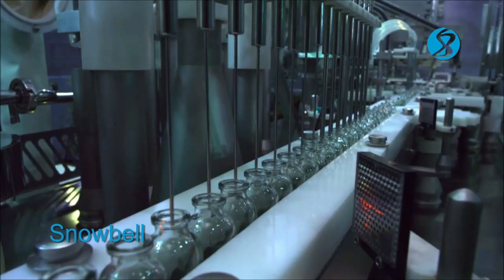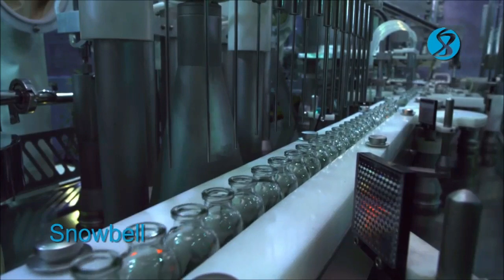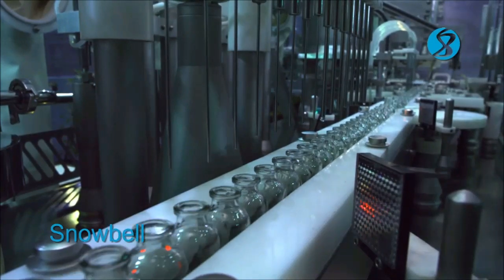The filling needles are lowered into the properly positioned vials and on completion of dosing retract.